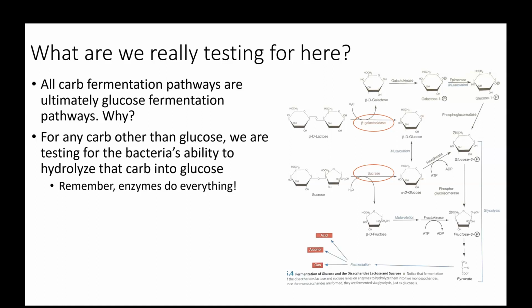So when we look at bacteria, again, other than glucose, what we're really doing is looking to see if that bacteria has the enzymes capable of processing these carbs into glucose.